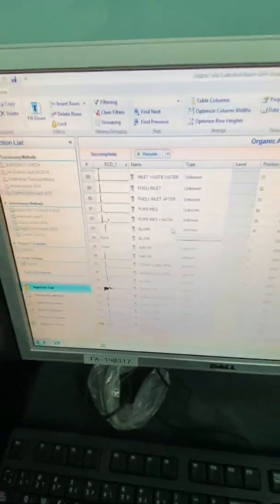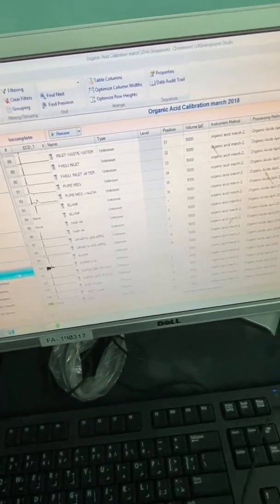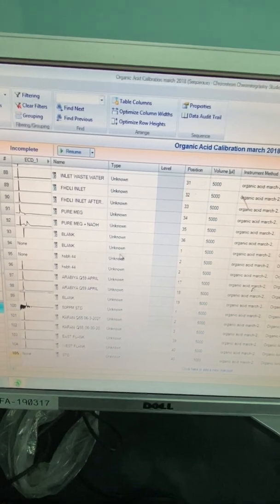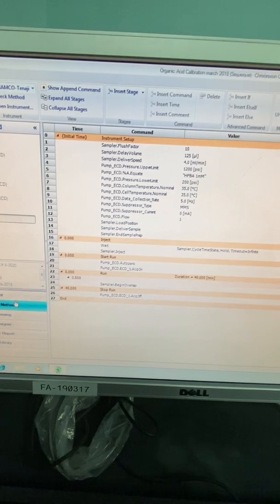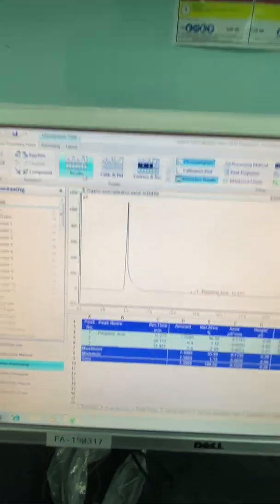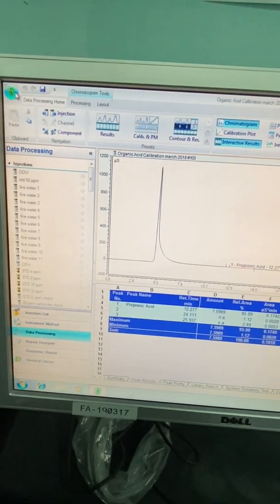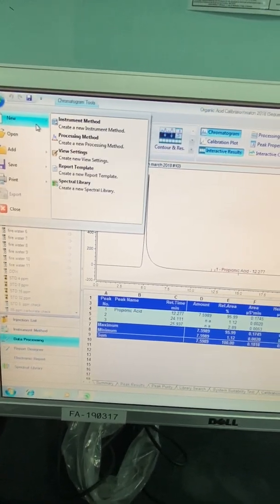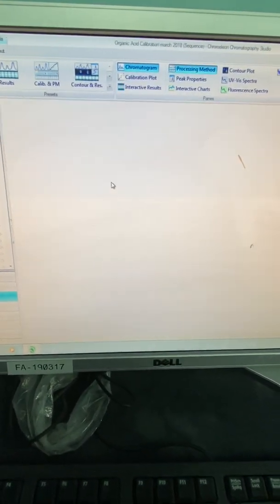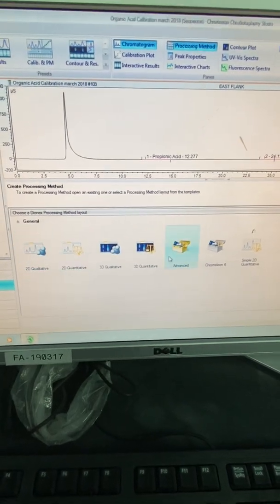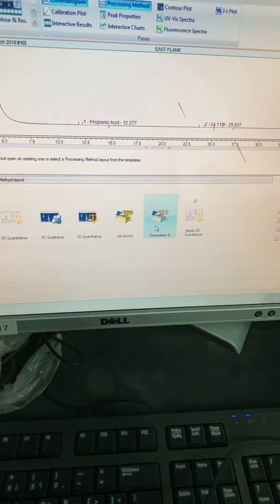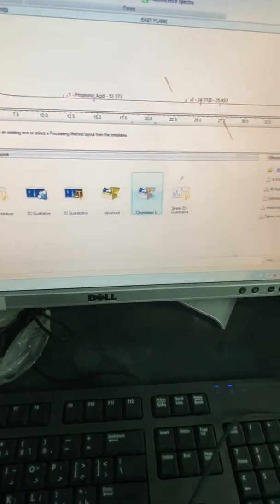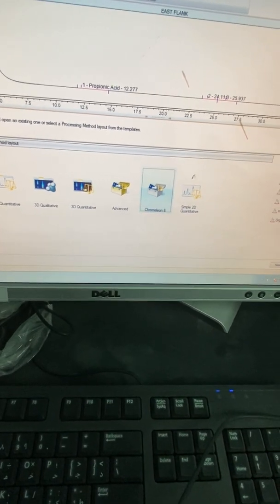Now consider you have injected your blank and the standard and you want to do calibration. So, first of all to do the calibration from your processing method. This is the data processing method. You have to mention like new processing method.